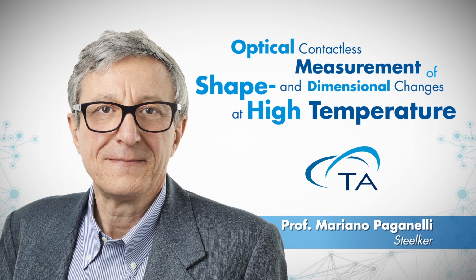What is my first use of the dilatometer? It is quality control on a metal sample or a ceramic sample up to 500, 700, 800 degrees. No doubt, use a mechanical one. But if the target of my research is to study the sintering behavior, the melting behavior, or whatever above the point, the transition point into the plastic state, the optical dilatometer is the only choice.